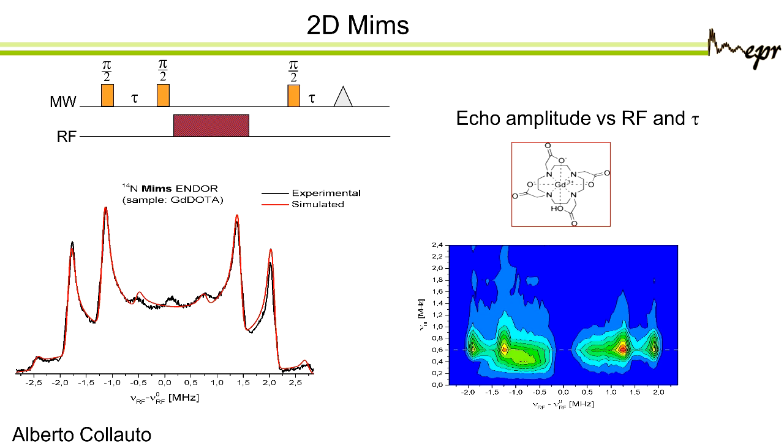You see the hyperfine coupling is very small, at most 0.6, and the quadrupole is large. These little lines in the middle come from contributions from other transitions, part of the signal from the other transitions. Then he could simulate it very nicely using this hyperfine and the quadrupole of the nitrogen. So you can do this type of experiment.